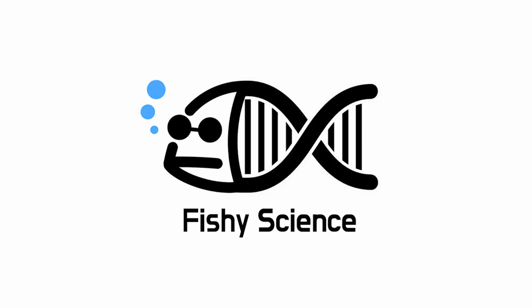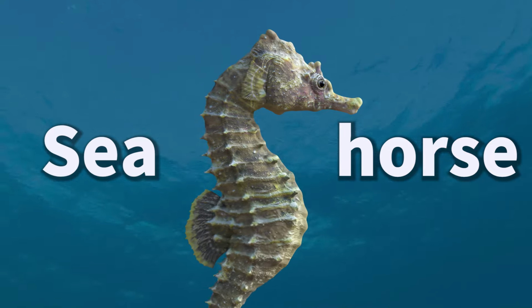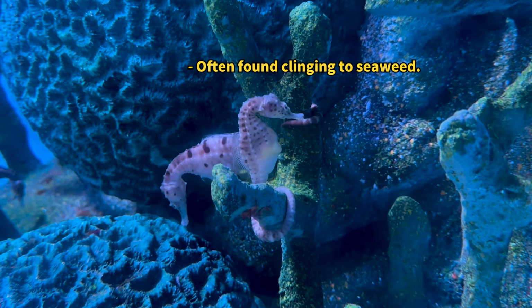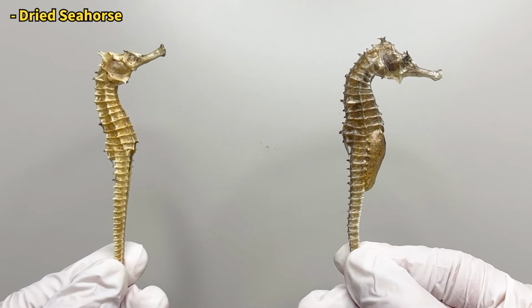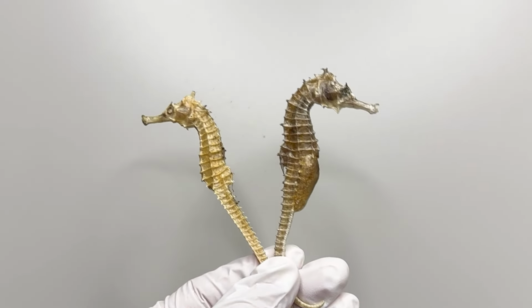Fishy Science. Today, we're diving into the mysterious world of how seahorses reproduce. Seahorses stand out as some of the most unique fish in the ocean. They're really special, not just in the way they look and act, but also in how they mate and have babies. Ta-da! To show you the special way seahorses reproduce, here we have a female and a male.